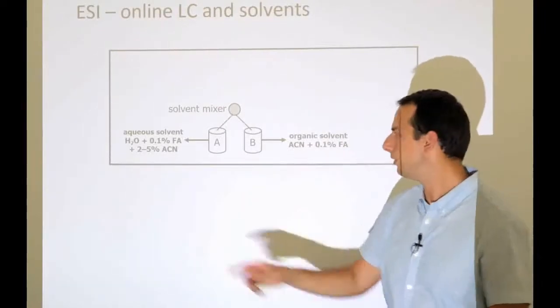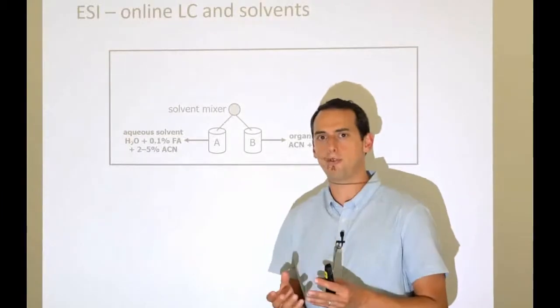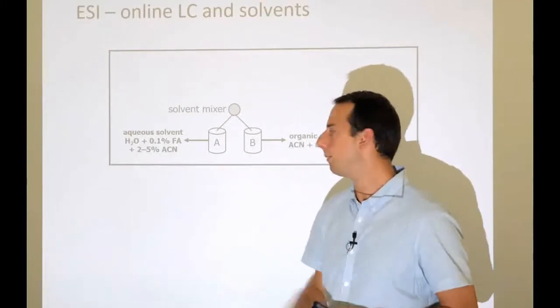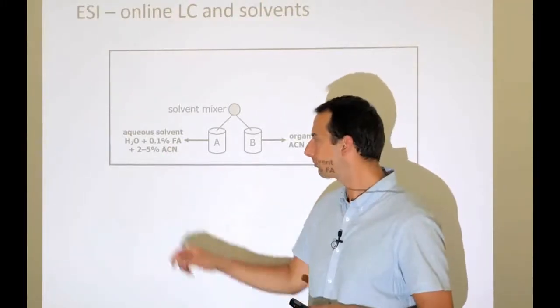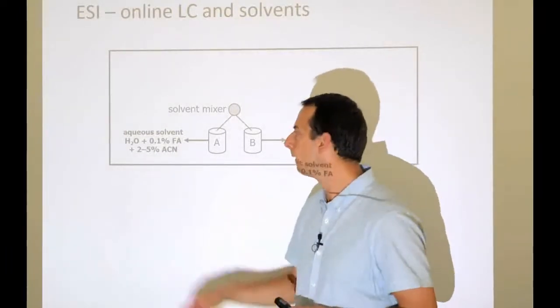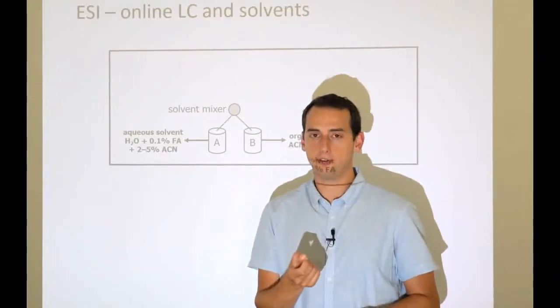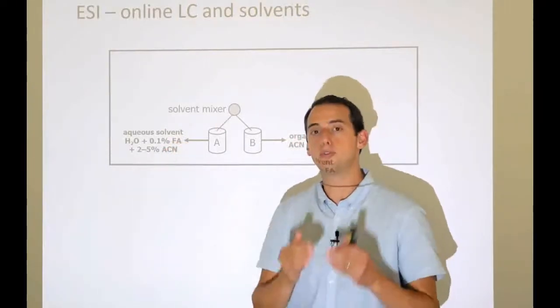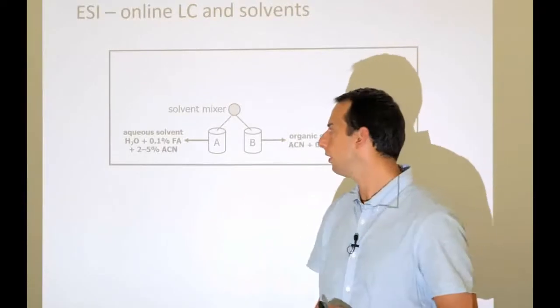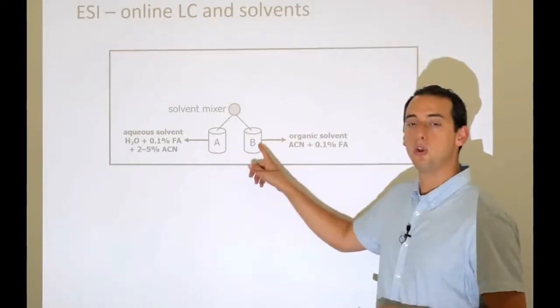Do you remember why we have these things? We need acetonitrile because peptides don't like pure water. They're a little bit hydrophobic, so we always need a little bit of hydrophobicity there to keep them happy, and that's where acetonitrile comes in. And acetonitrile obviously dissolves quite well in water because it's a little bit polar. Formic acid is because we want to make sure that all our peptides are positively charged. So this formic acid serves to reduce the pH and that we have well positively charged analyte molecules in our mixture. We start with that and with no B at all.